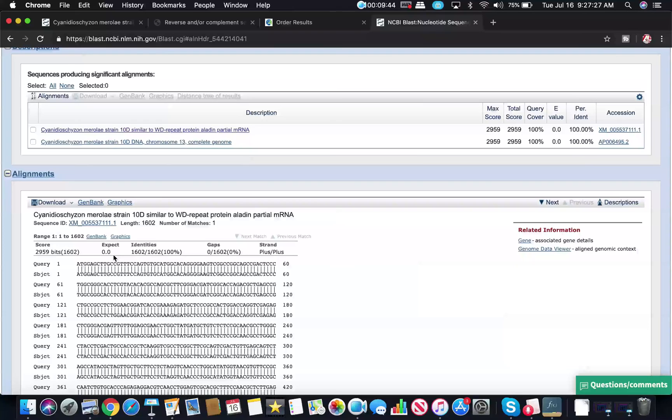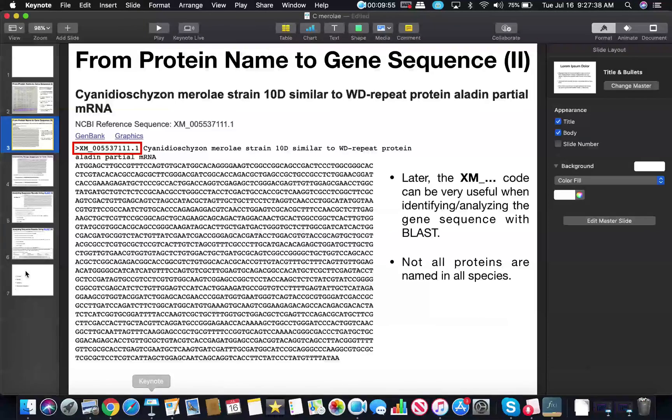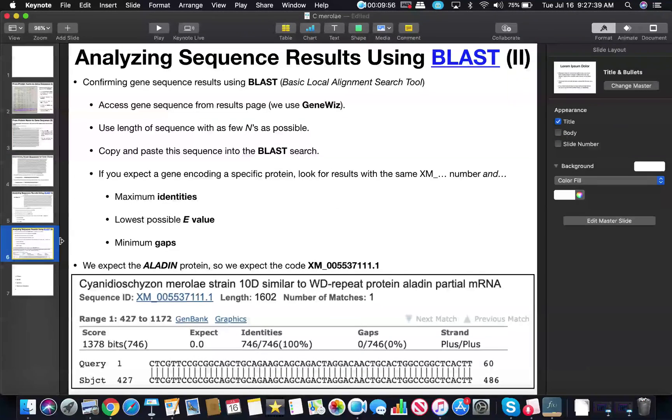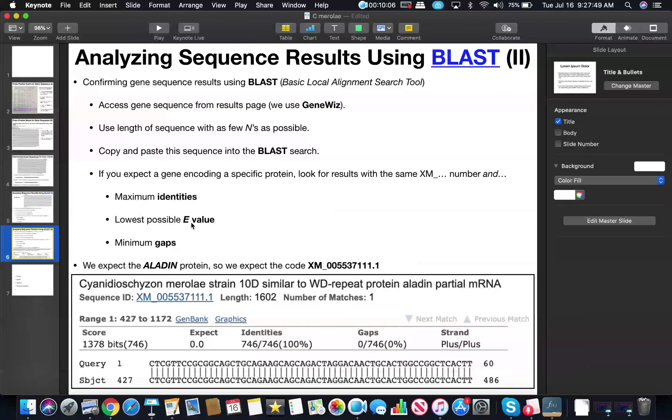Well it's a zero percent chance, which means that there is 100% certainty that the gene sequence we input is this gene. If this were a higher number, it would basically decrease the chance that you have a match. So you want this expectation value to be as low as possible, and sometimes you'll see this referred to as an E value.